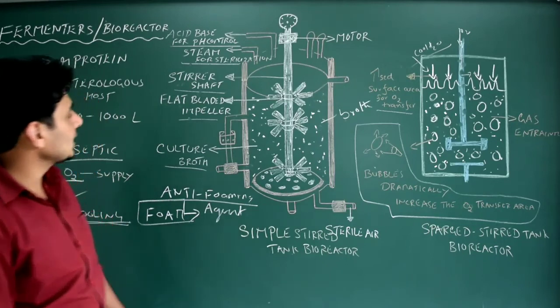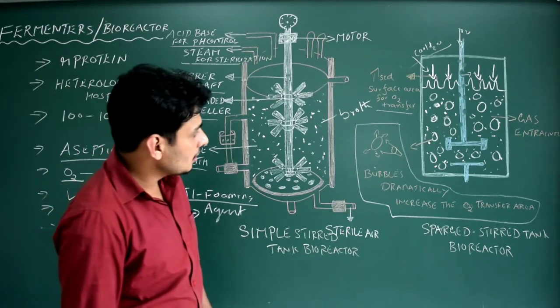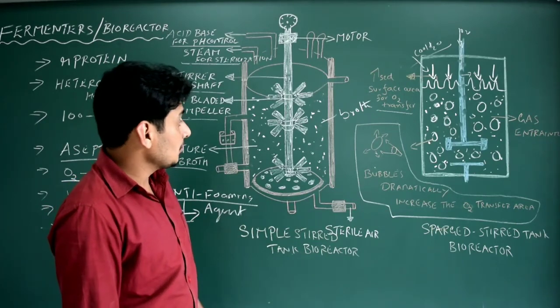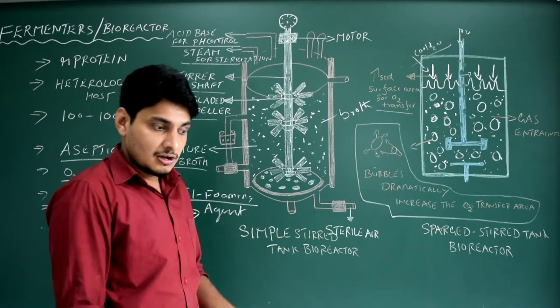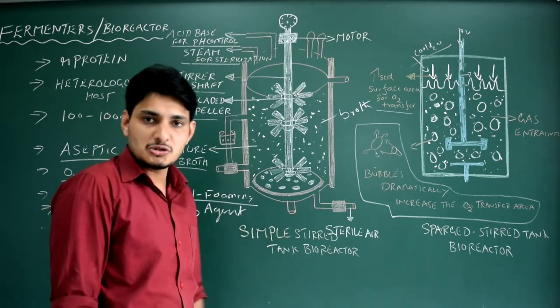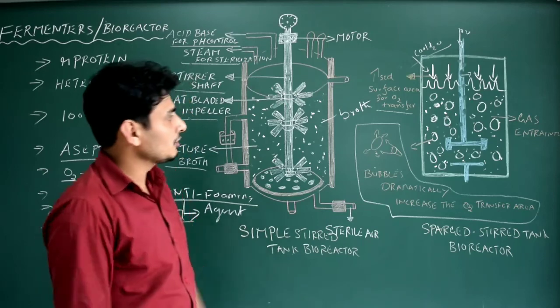Okay, we will continue with one more concept, the continuation part of the bioreactor, that is the batch system. There is the fed batch system, the continuous batch system, and the sterile batch system as well. We'll talk about it one by one.